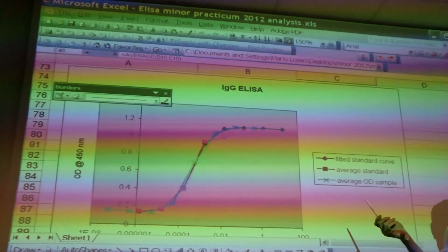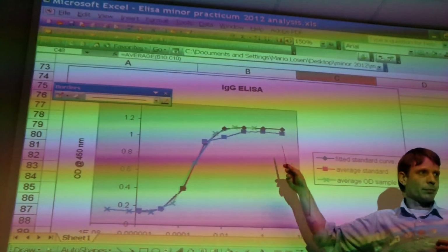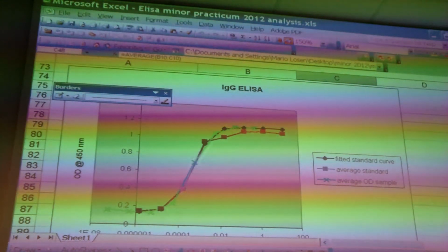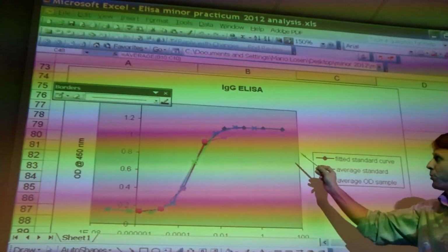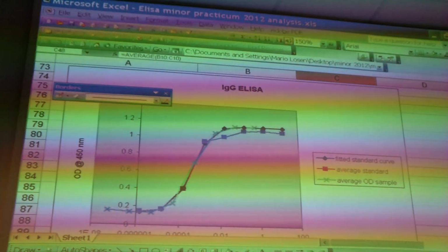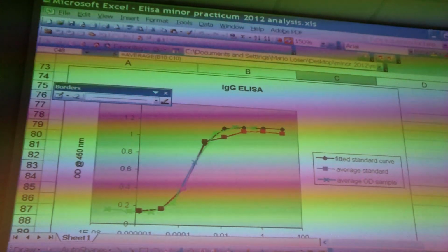And what we then did, using Excel and the data fitter, is we assumed a concentration, calculated how far away all the points are from the standard curve, and then improved this prediction by adjusting the concentration that we assumed. In the end, we got a very nice fit between the two. And that told us this was the real concentration. You follow that? No. Okay, I thought so. Not a bad explanation.